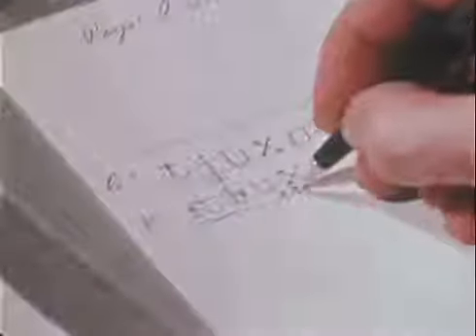He continues his comparison letter by questioned letter. The dissimilarities mount up. When the job is done, it is quite evident that the questioned extortion note was not typed on the machine available to the suspect. Reports sent to the requesting agency by the FBI laboratory examiners may indicate innocence as well as guilt.